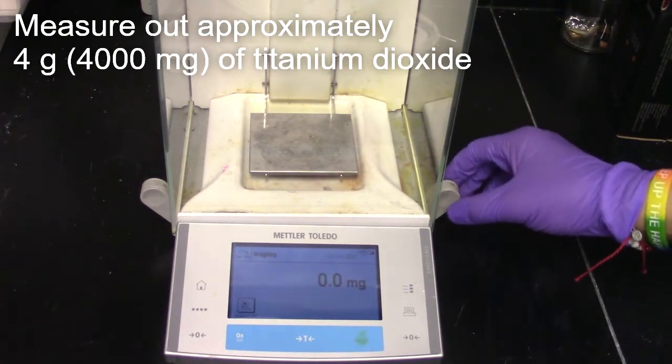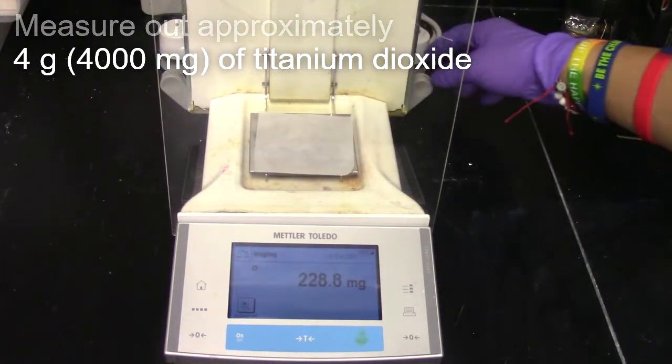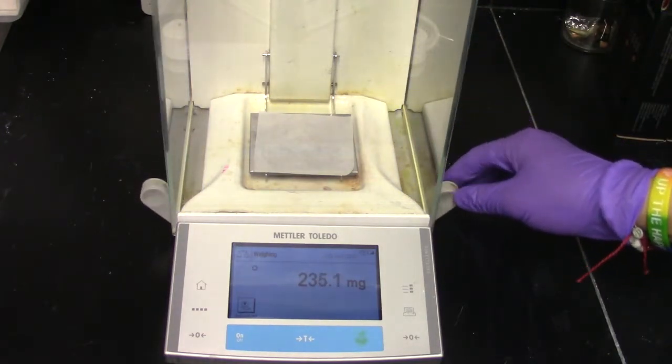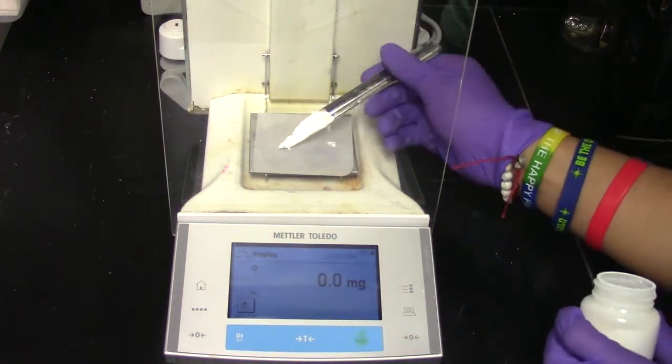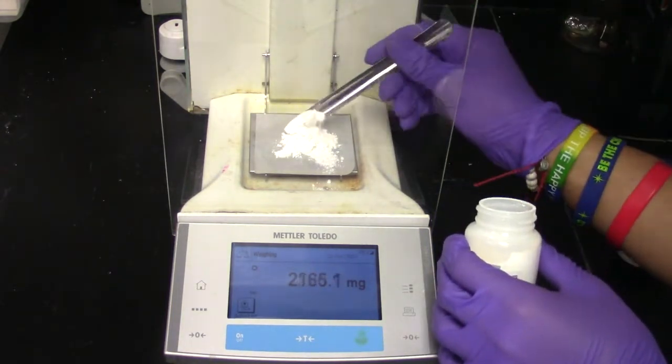Measure out approximately 4 grams or 4,000 milligrams of the titanium dioxide. As a note, measuring below or above the 4 grams will not have a significant effect on the paste.